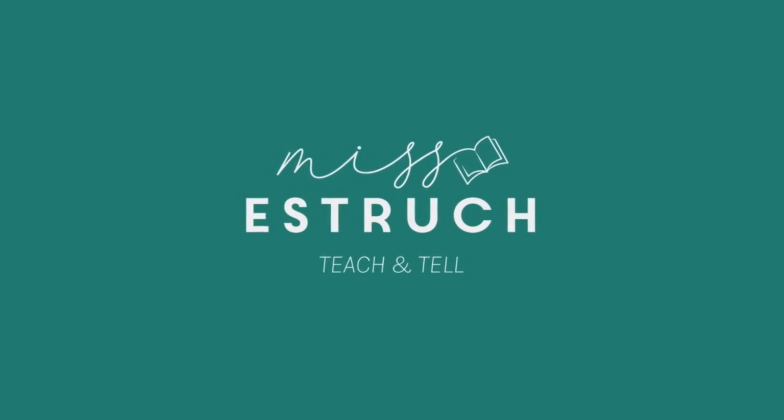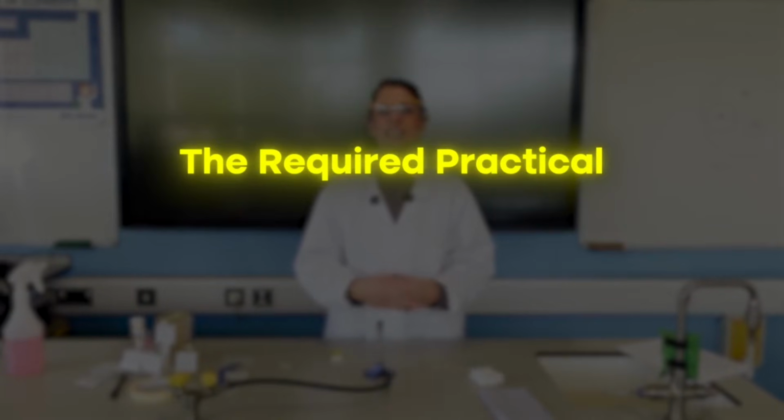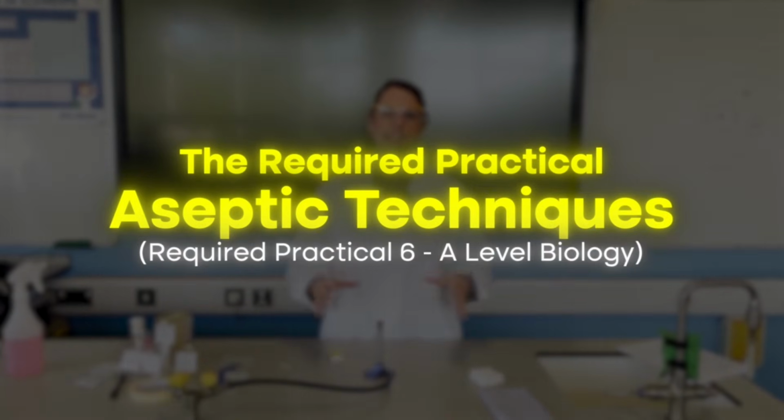Hey everyone, and welcome to Miss Estruch Teach and Tell, and in this video I'm going to be going through required practical 6, the aseptic technique to create an inhibition zone for A-Level Biology.